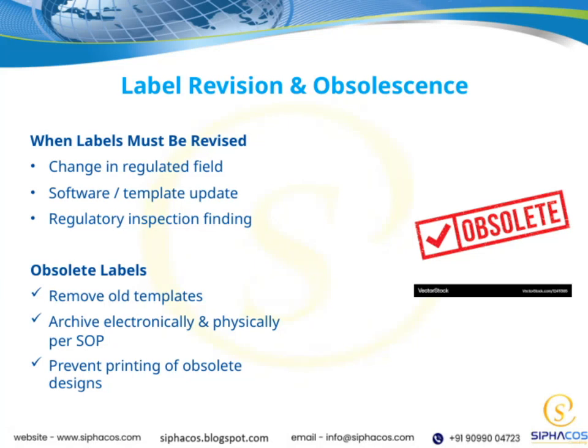Let's talk about label revision and obsolescence. First, when should labels be revised? Well, there are a few key situations. One is when there's a change in the regulated field, meaning if the rules or requirements from regulatory bodies change, our labels need to reflect those updates.